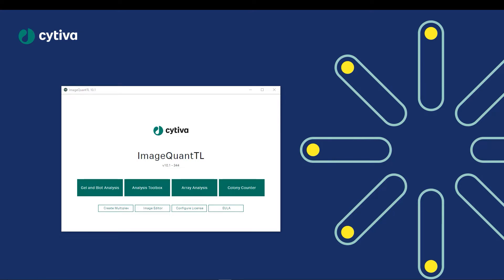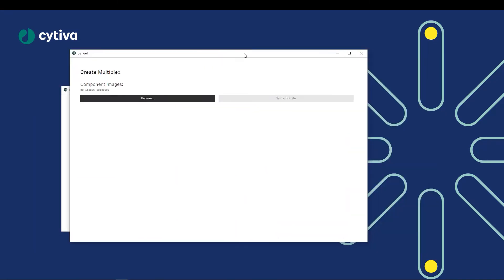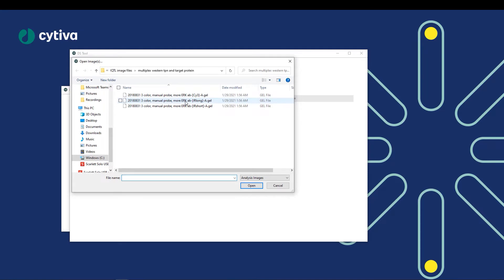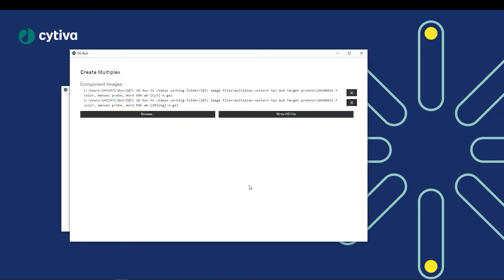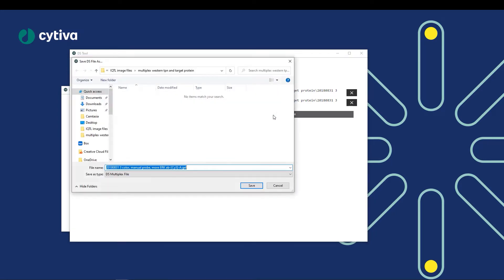Before we begin our analysis, we must create a multiplex image using the Create Multiplex function in the ImageQuant TL version 10 main hub. From here, you can browse and select the files you would like to combine into your multiplex image — they must come from the same folder. Once chosen, you can write the DS file (which stands for data set) and save it into the same folder as your individual images.